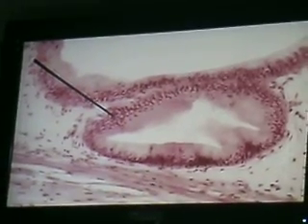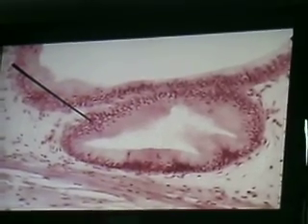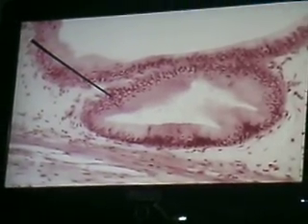Now, pag pinakita kong ganyan, what is the organ in focus? Gallbladder. When we show you the RA sinus, dapat alam nyo, this is the gallbladder. That is the technique in doing the practical. Know the organ in focus first, bago yung malama ko ano yung side question. This one, when we show you this, organ focus, gallbladder. Identify structure and pointer.